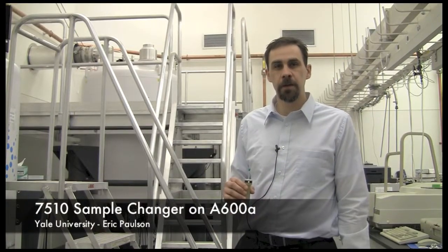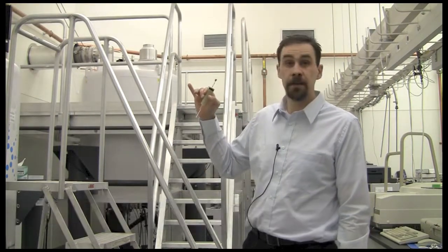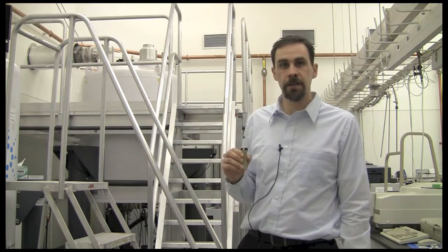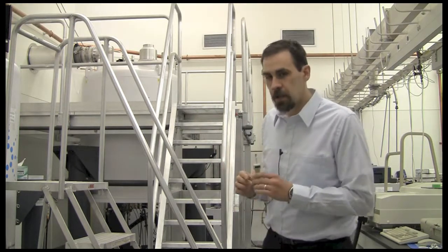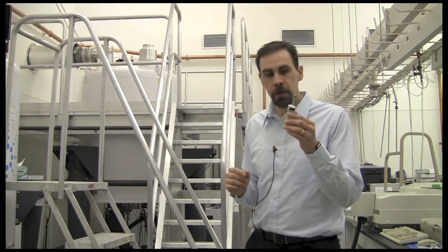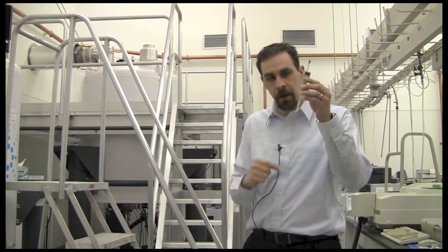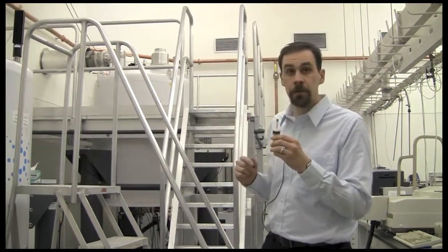This is an explanation of how to use the 7510 sample changer on the A600A. To use it, the first thing you should do is put your sample in the depth gauge and prepare it at the proper height before you go up to the sample changer.